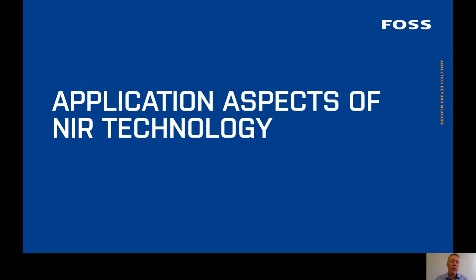Now let's have a look at different application aspects of NIR technology. Different sample types and applications require different measurement geometries, or so-called sample presentation, in order to achieve the best possible analytical results in the end. This final part goes through the four most common measurement geometries, their advantages and typical uses. In the end, I will also explain how high performance is maintained over time and the ability to use calibrations developed on one instrument on another instrument, the so-called transferability.